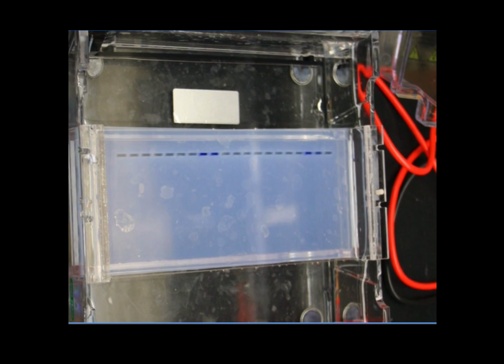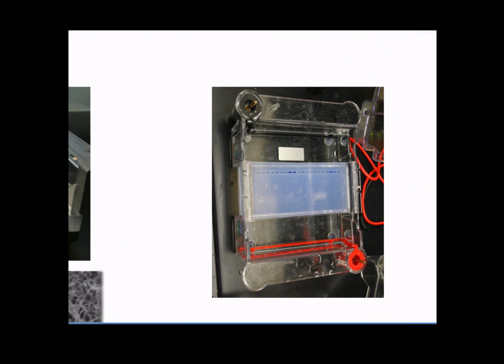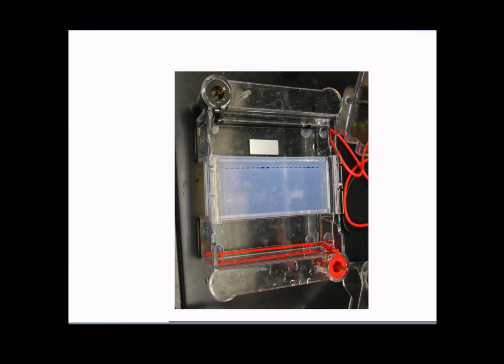In this image, you can see some of these wells are occupied by some blue liquid that indicates the presence of a DNA sample in them. Right? So not all wells have been loaded here. A few of them have. All right, so without knowing much more, you can probably appreciate that DNA will be in these wells on one end of this gel. And I told you that this gel is like a 3D mesh that offers some resistance to different molecules of DNA of different size. So smaller DNA molecules will have lesser trouble going through those pores. Larger DNA molecules will have a little bit of a harder time.